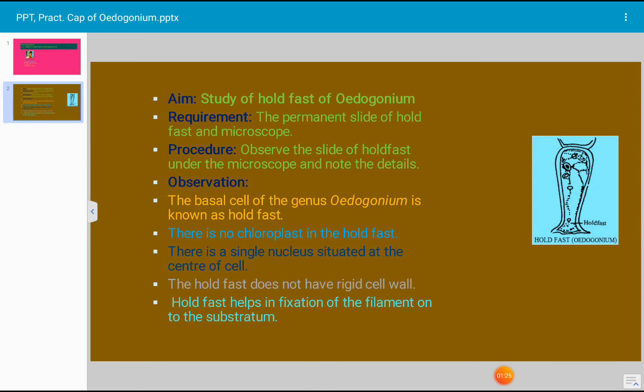There is a single nucleus which is situated at the center, and the hold fast does not have rigid cell wall. Cell wall is not rigid, and hold fast helps in fixation of filament on the substratum. These are the characteristic features of hold fast cell of the Oedogonium.